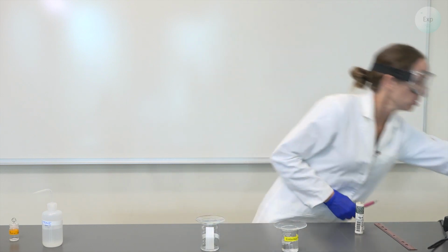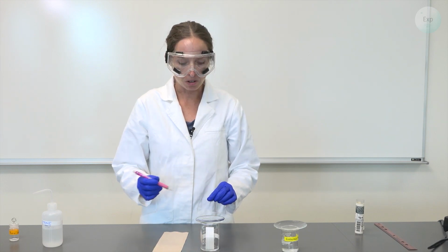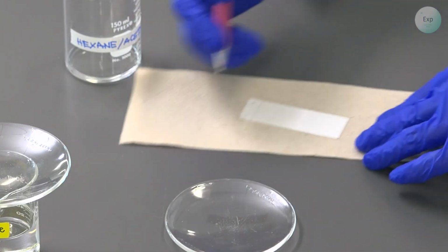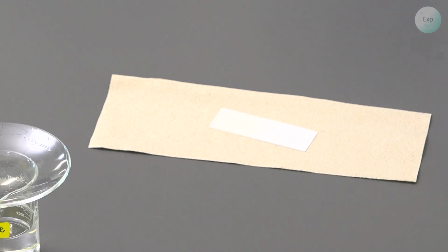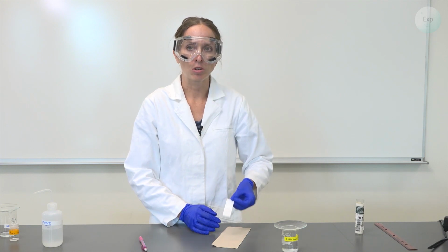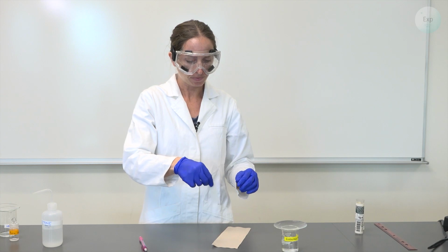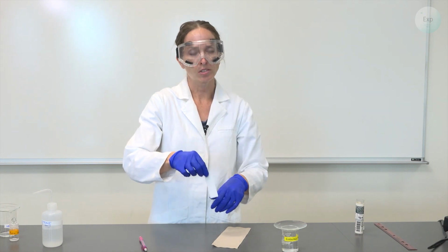I'm going to get a paper towel to place it on once I remove it. And the moment I remove it, I'm going to have my pencil ready to mark the line of where the solvent front had ended up. We will need to evaporate the solvent before looking at the TLC plate with the UV lamp. So I can wave this or blow on it, or if you have an air connection in your lab, you can blow air on it that way as well. It still feels quite cool to the touch. There is still solvent there.